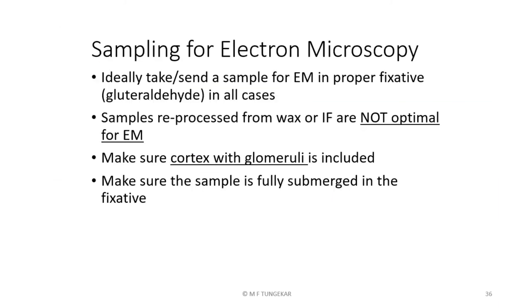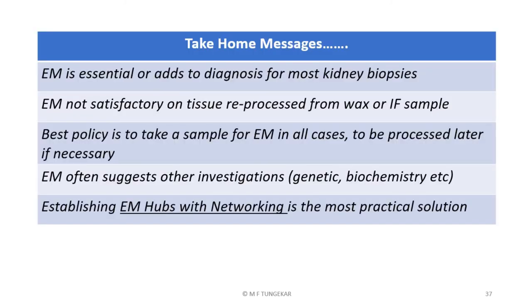A few brief suggestions for sampling for electron microscopy for nephrologists: ideally, take a sample for EM in a proper fixative in all cases — they can then be processed if necessary. Samples reprocessed from wax or IF are not optimal for electron microscopy; full analysis cannot be done on those samples. Also, make sure that cortex with glomeruli is included — although some conditions can be diagnosed by tubular morphology, most diagnoses are rendered on glomerular abnormalities. Also make sure the sample is fully submerged in the fixative.